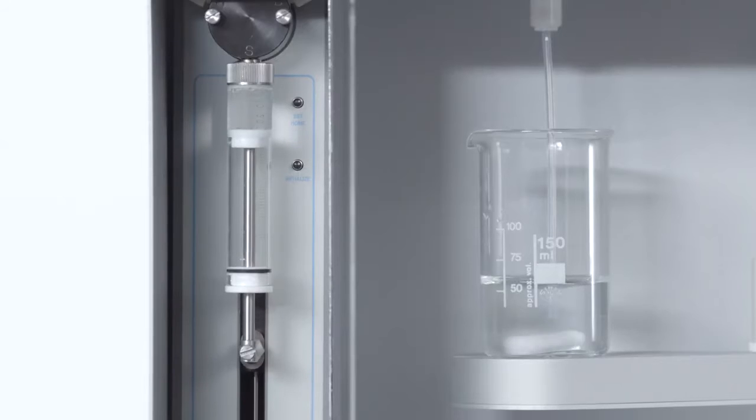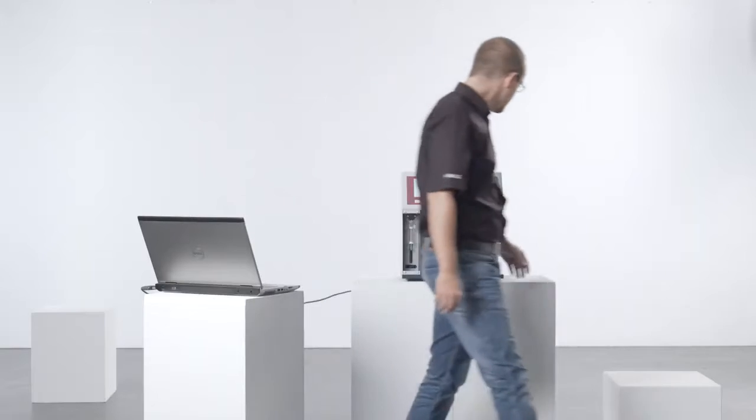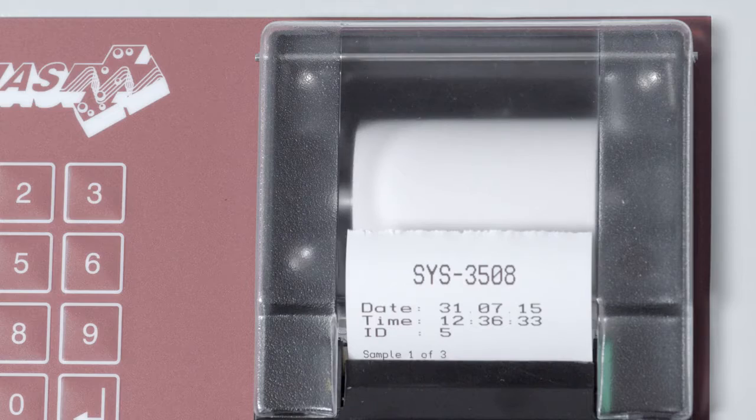Any volume from 1 microliter to 2,000 milliliters can be analyzed.